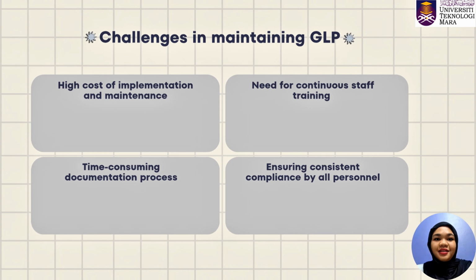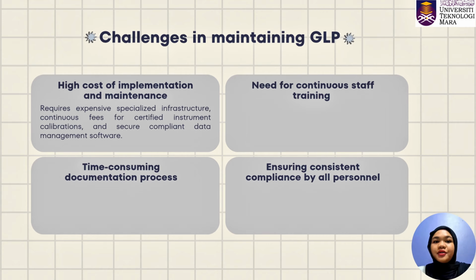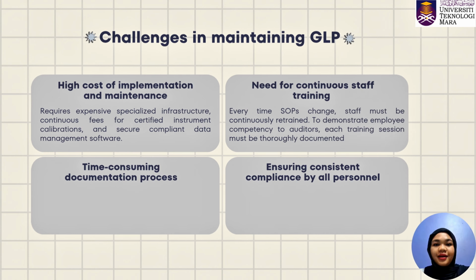And lastly, the challenges in maintaining GLP. First, high cost of implementation and maintenance requires expensive specialized infrastructure, continuous fees for certified instrument calibrations, and secure compliance data management software. Second, need for continuous staff training.